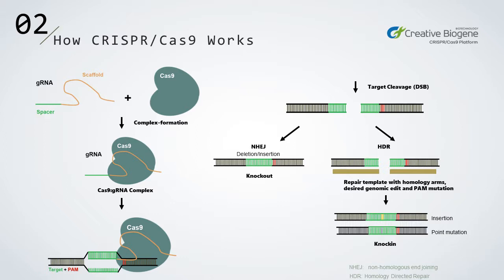According to the application, the repair template can be a single-stranded oligonucleotide, a double-stranded oligonucleotide, or a double-stranded DNA plasmid. Do not include PAM sequences present in genomic DNA when designing repair templates, which prevents the repair template from becoming a suitable target for Cas9 cutting. By designing specific guide RNA sequences and inducing appropriate downstream repair mechanisms, we can use this method to flexibly achieve targeted modifications of the genome.